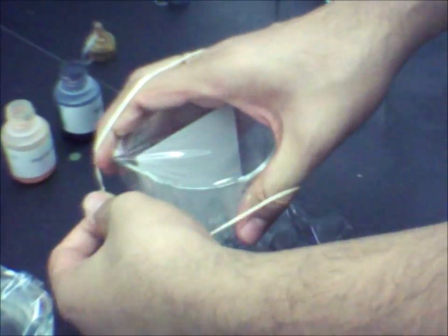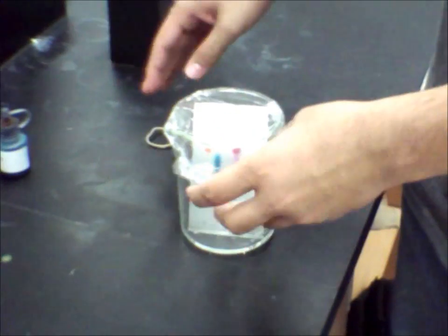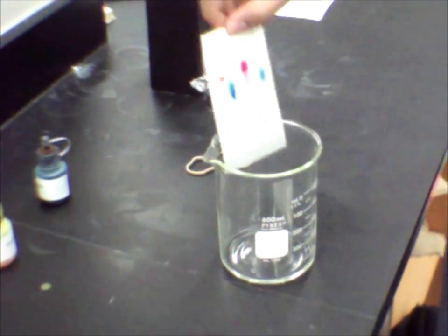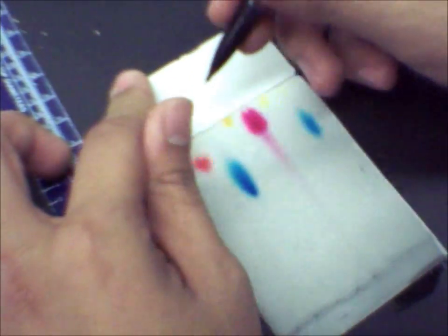Let it sit until the dye components have fully separated. Then take the chromatography plate out and measure the necessary data, such as distances of components traveled up the plate, as well as retention factors, which is the distance traveled by components divided by distance traveled by solution. Make sure you record your data to one decimal place.